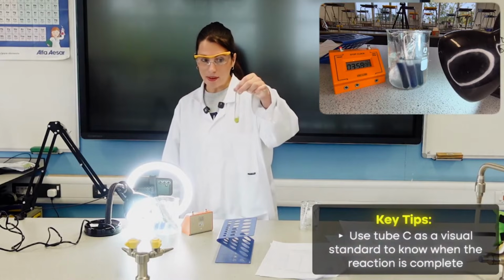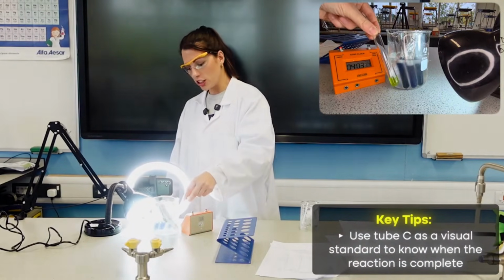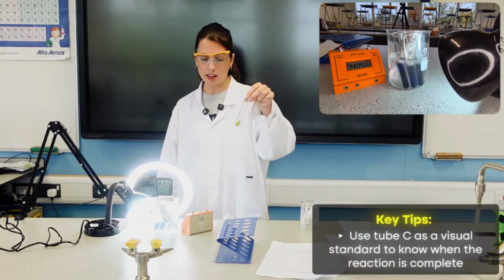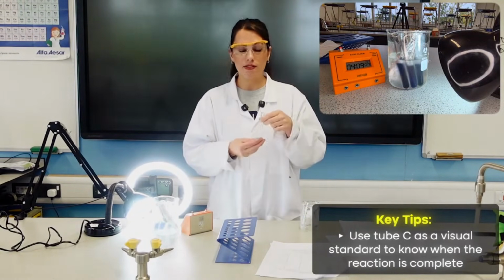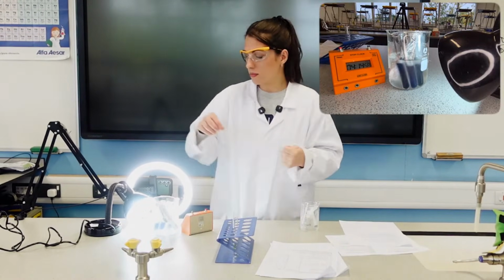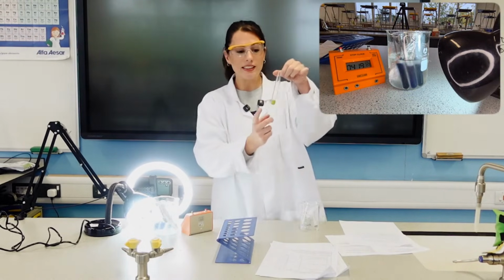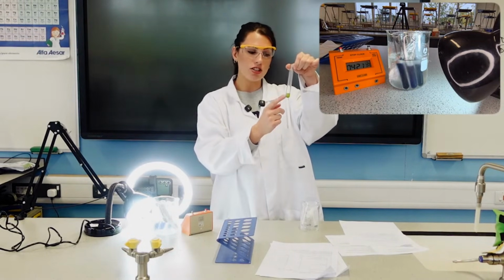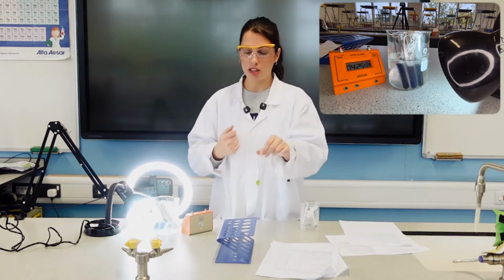Make sure they don't forget about test tube C and that they are using it to compare to their test tube, so they know that is the colour standard to compare to, and that they understand that is because colour change is subjective, so we need some way to standardise it. Now you might use a colorimeter with this, in which you take out samples, put them in, and test the absorbance. When the absorbance is the same as the absorbance for this test tube, that is your endpoint, as a way to standardise it even more and make it quantitative.